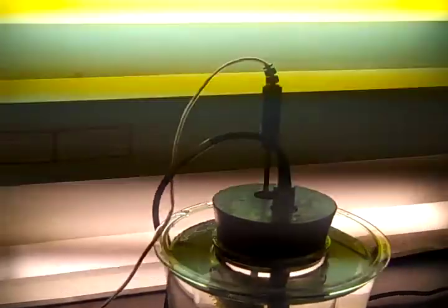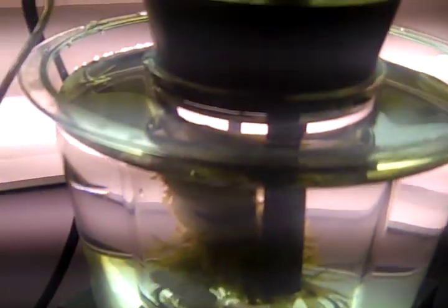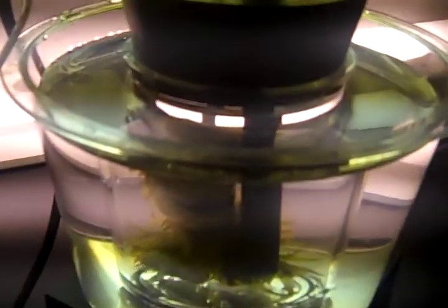The purpose of this lab is to measure the difference in dissolved oxygen when there's a plant inside the water and without plants in the water. And to measure temperature change using plants.